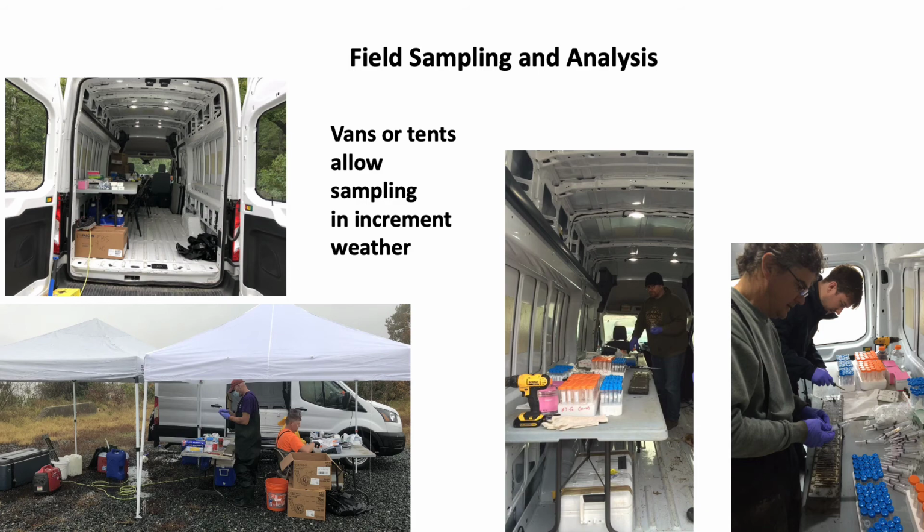Field sampling and analysis. The samplers should be sampled as soon as possible after they're removed from the sediment to prevent any type of changes, which are typically due to redox changes in the geochemical species.